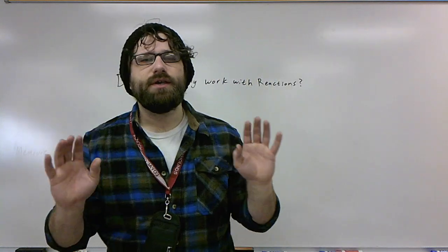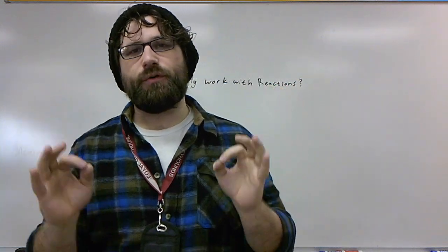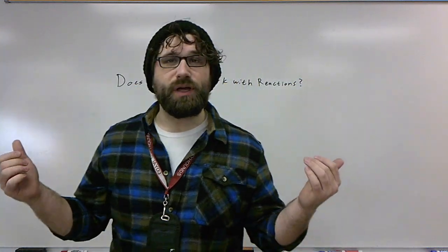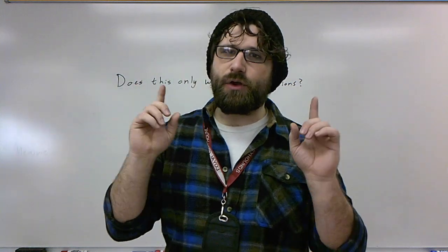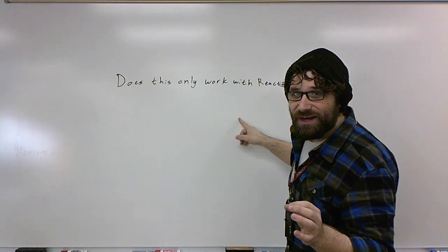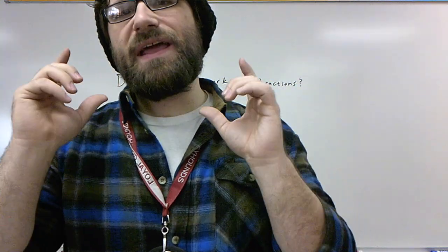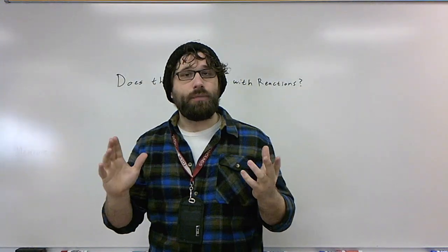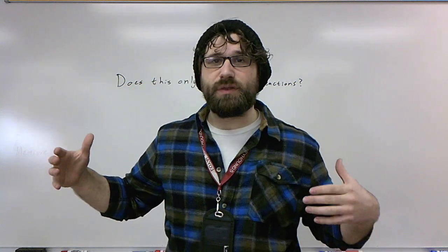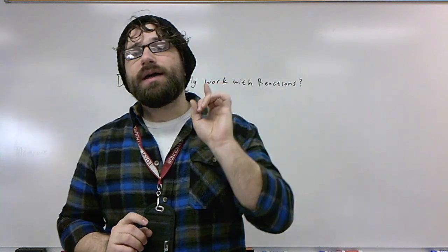Okay, what's up guys? So, today we are going to continue investigating this model for thermodynamics. We're really trying to get a full explanation here. Hopefully we'll get an explanation for a lot of different things. The question we're specifically looking at today is, does this only work with reactions? Does that temperature change only happen in a chemical reaction? So we need to look at a physical change where we have components that are starting at the same temperature, and then see, does it change temperature when these components interact without a chemical reaction? So keep that in mind.